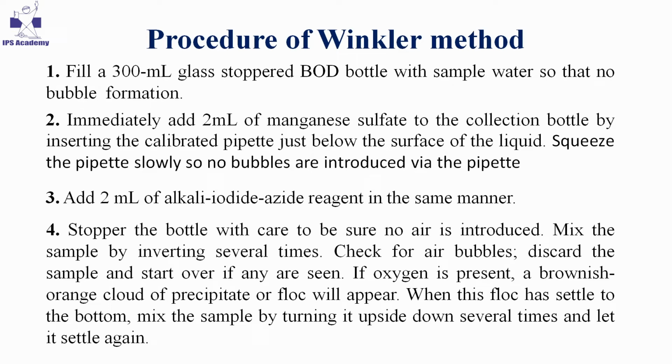Then mix the sample by inverting the bottle several times. If any air bubble formation takes place in the bottle, then throw away the entire mixture and repeat the step of collection of water sample.